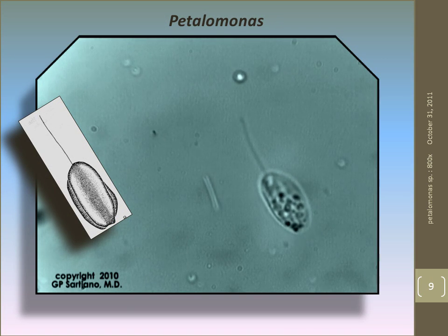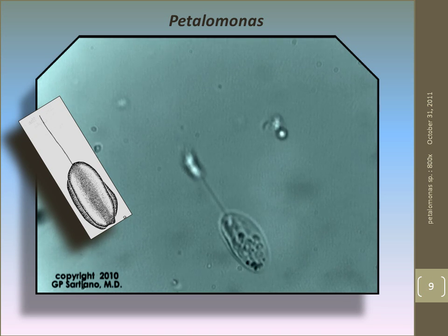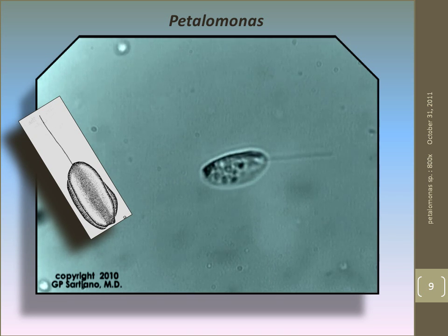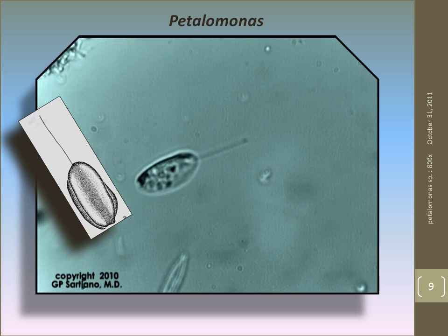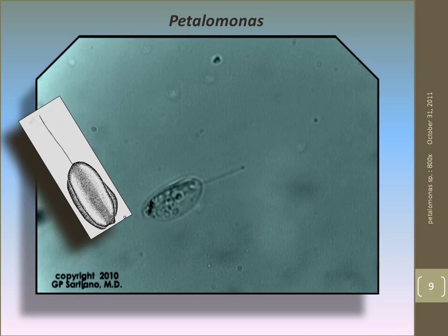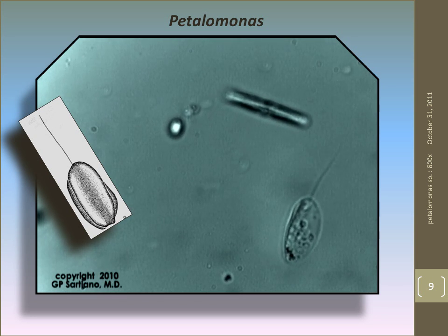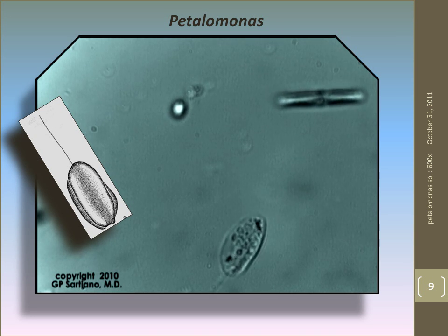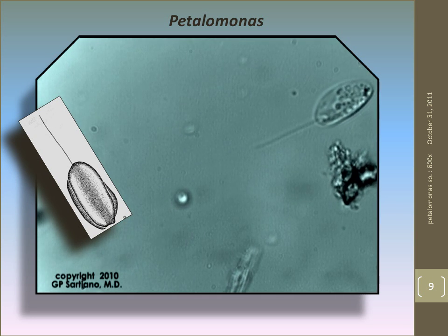Here, one can observe the flagellum rigidly extended anteriorly, with the tip actively gyrating. The organism's upper border shows a wing-like membrane which runs the entire length of the organism's body. Note here that the purportedly rigid anterior flagellum is really quite flexible and is used to detect objects in the environment and initiate directional change.